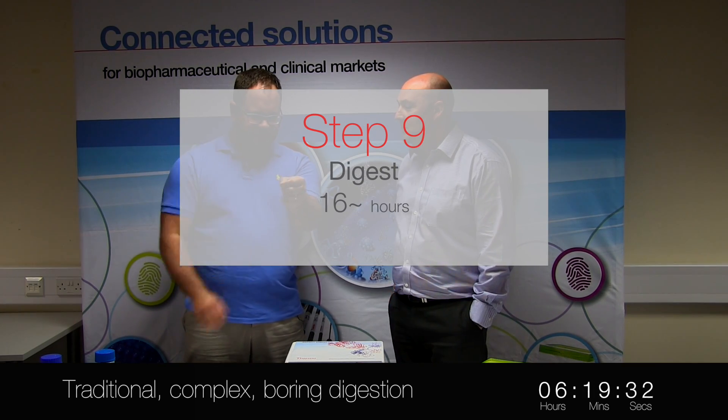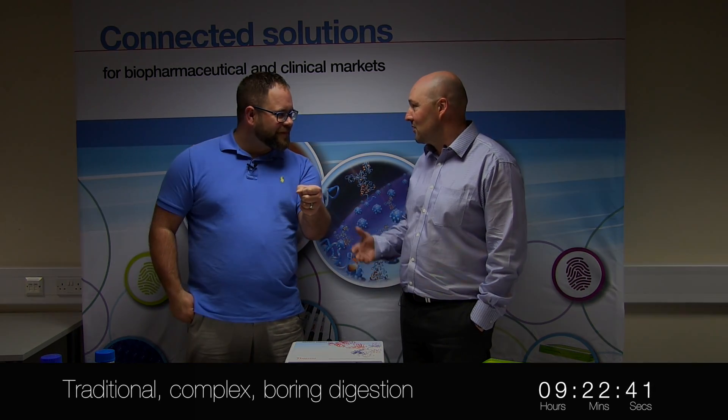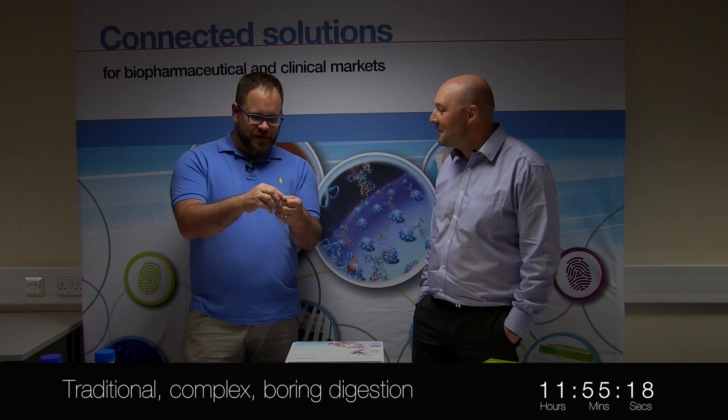Leave it overnight at 37 degrees — you can incubate it again at 37 degrees. So it's the end of the day, you can go home, drive home, get home, see the curtains. OK, so that was a whole day. That was a whole day.